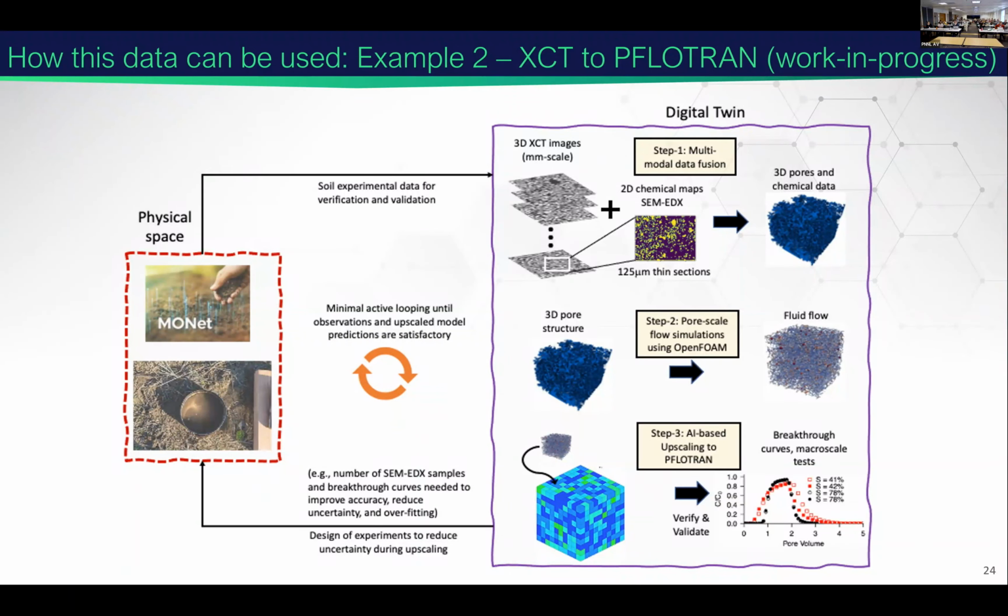And you want to fuse that. That's more than 1 billion cells, and you want to model the fluid flow in those 1 billion cells. That is extremely computationally expensive. So what you do is chunk out different parts of the core, model those specific aspects, and construct fluid flow simulations representative of that core.